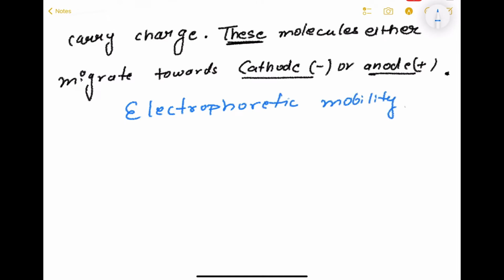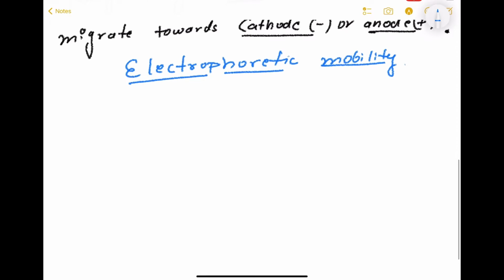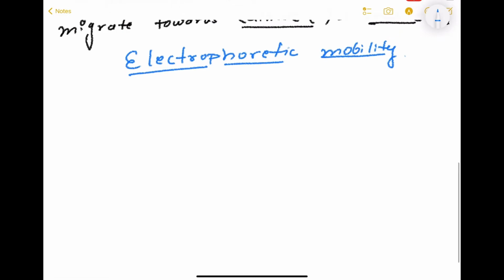Breaking the term down, it means the movement of molecules when electricity is applied to them, moving towards either cathode or anode depending on the charge they carry.